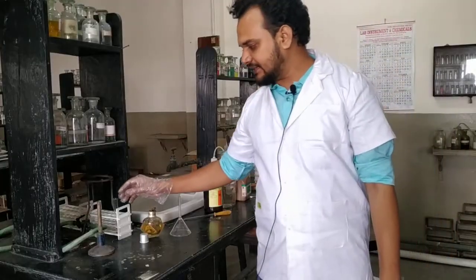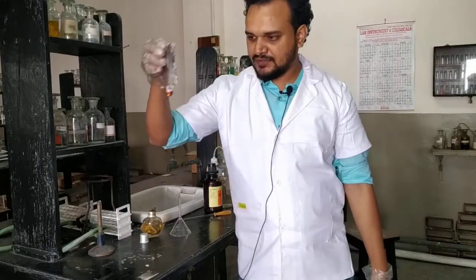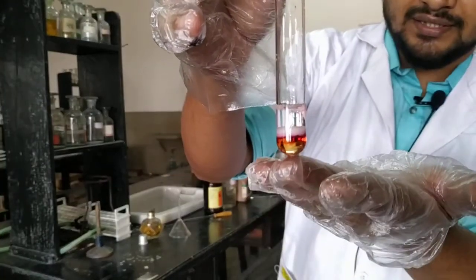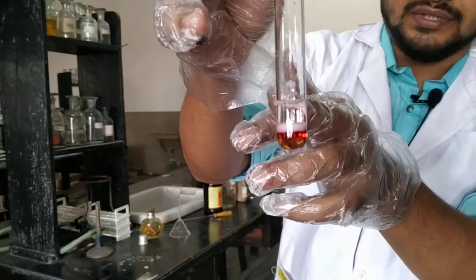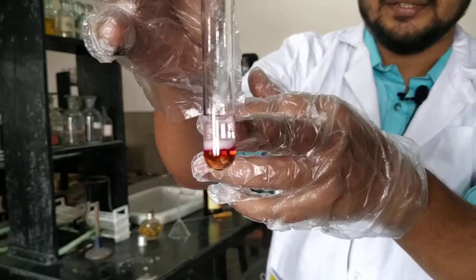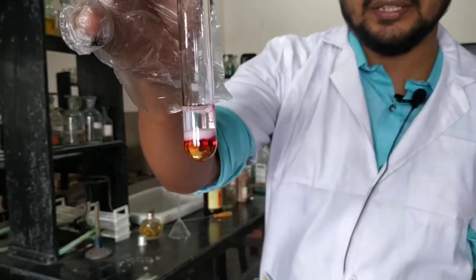After 2 minutes of standing, let us see the result. Yes, here is the result. The bottom is the organic layer and above is the aqueous layer. As I said, there is white precipitate on the aqueous layer — see, white precipitate like cotton. And at the junction you can see a beautiful reddish ring.